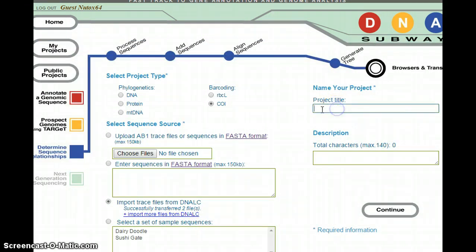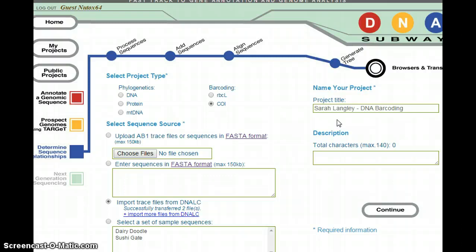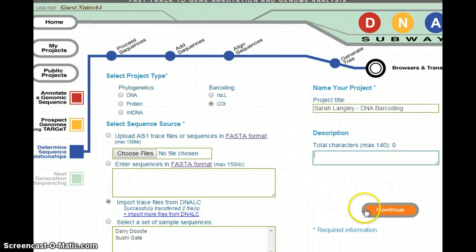Once your sequence is uploaded, go ahead and give it a project title. Your project title can be your name, ending with 'DNA Barcoding.' Keep in mind that after one day, you will be signed out as a guest and you'll have to log in using this same process all over again. Your description — you can add one in if you'd like, but it's not required. Once you have this information entered into DNA Subway, go ahead and click Continue.